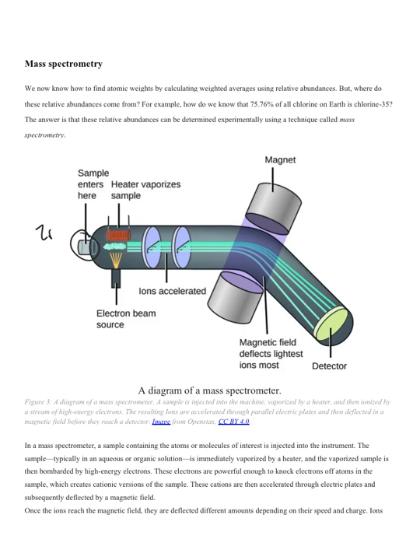Now you'll notice that from here, this line right here is deflected the most by the magnet. This isotope is deflected the least. The first question I would have for you is, which would be deflected the most or least? The isotope that is the heaviest or the lightest?